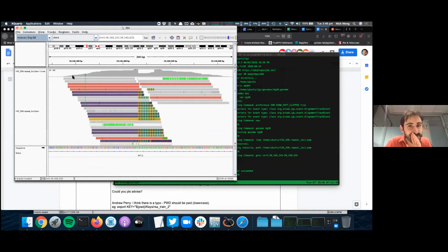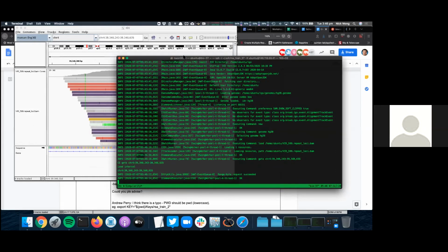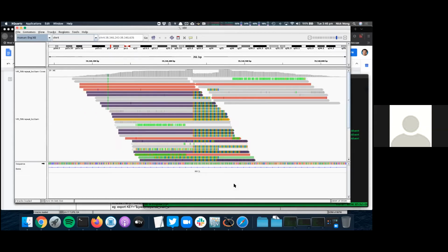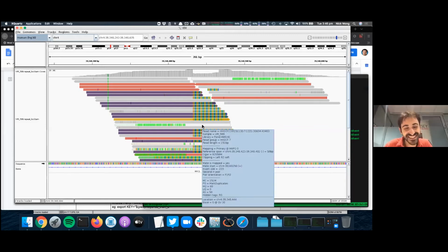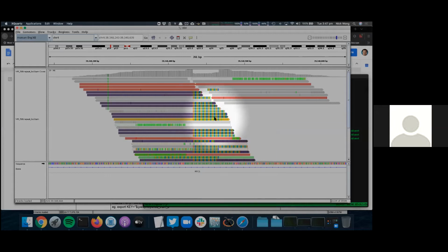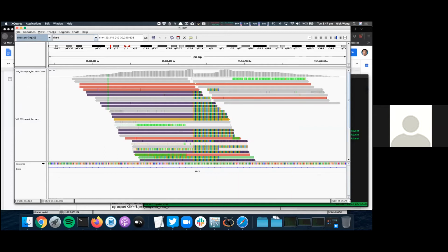Sarah, help, are you there? Hey, yeah. So this is showing reads from whole genome sequencing for an intron in RFC1. Marco has soft clipping enabled, so what you can see with all the little vertical stripes is where the reads aren't fully matching to the reference genome, which is at the bottom. And this is actually a disease locus, so I supplied it because I thought it was really interesting. This individual is carrying repeat expansion disease, and you can actually see it here in their sequencing.